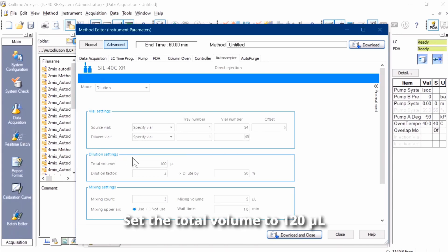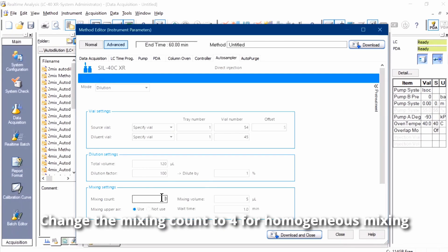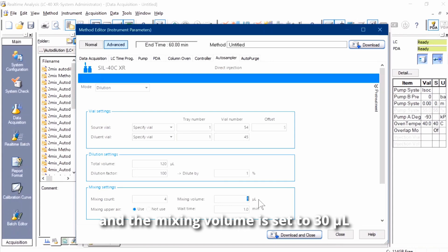Set the total volume to 120 microliters and set the dilution factor. Change the mixing count to 4 for homogeneous mixing, and the mixing volume is set to 30 microliters. Use is selected for mixing upper air, and the wait time is set to 1 minute. Click Download and Close.